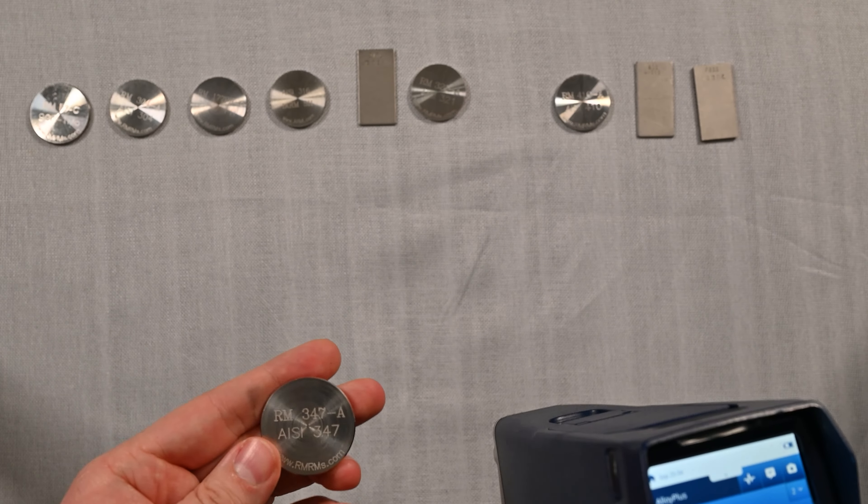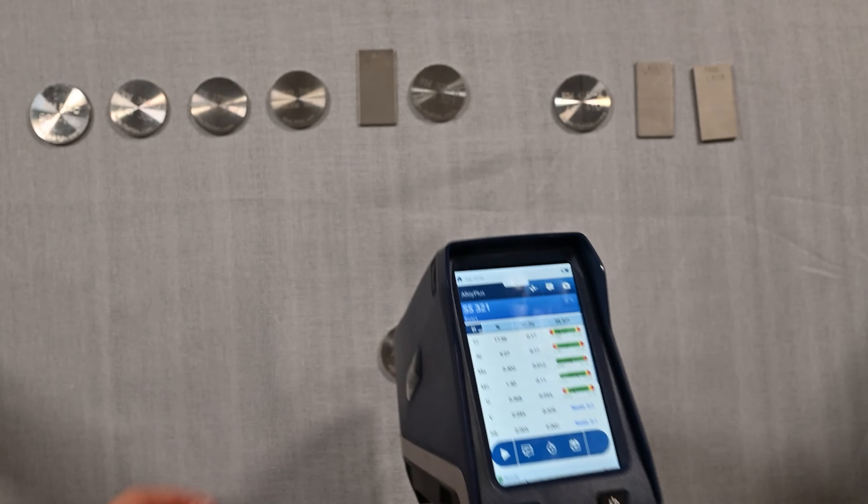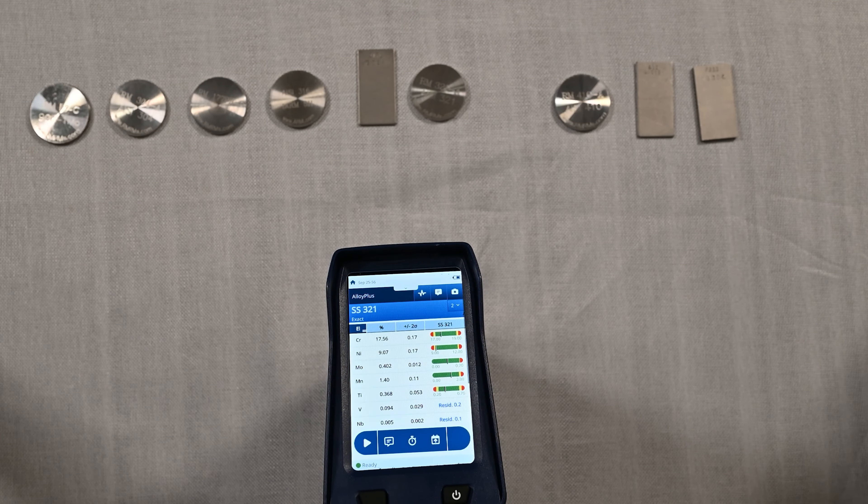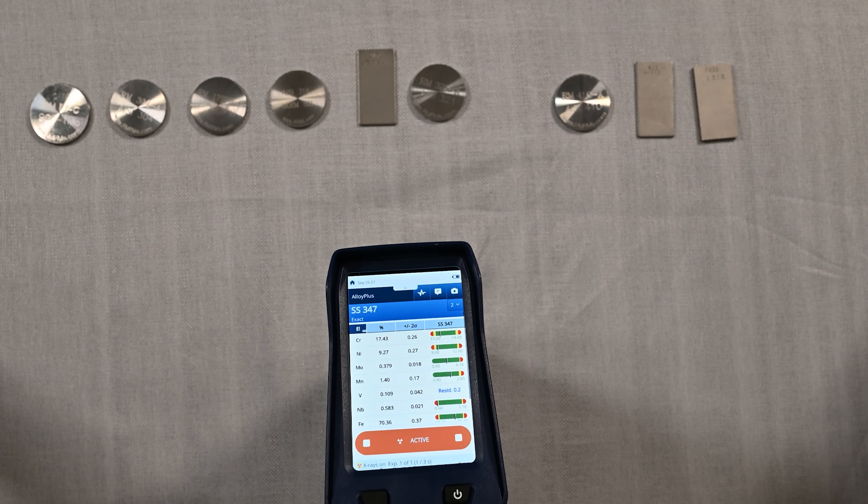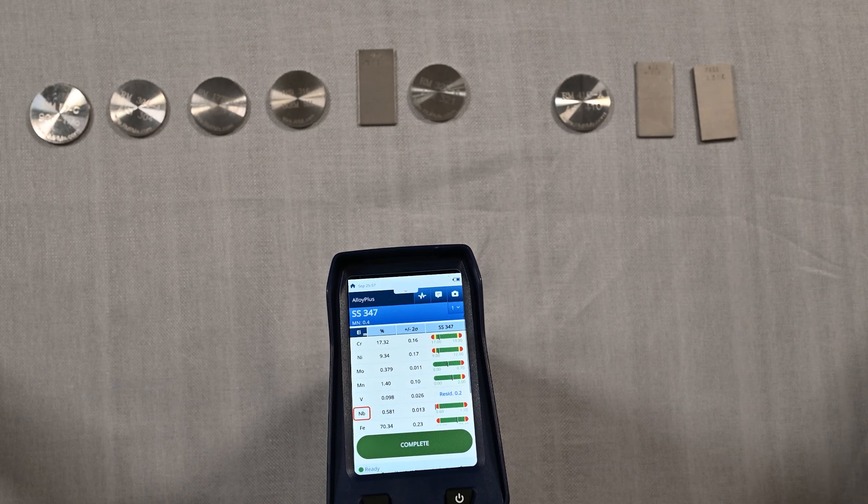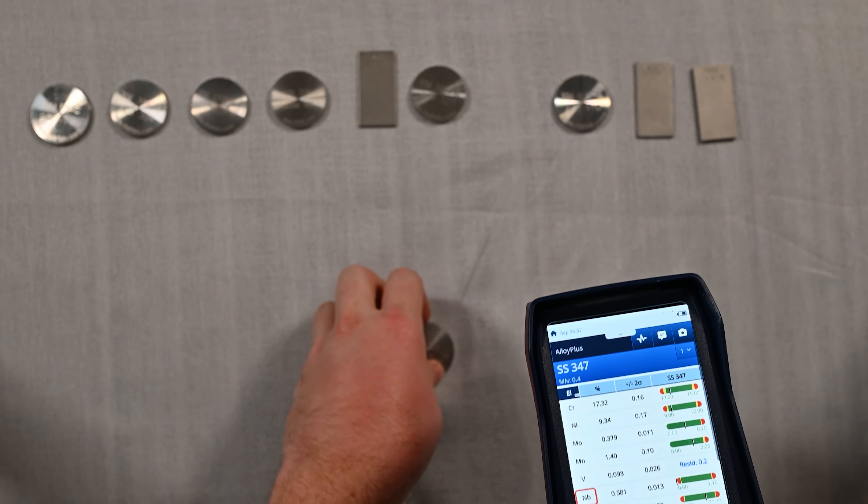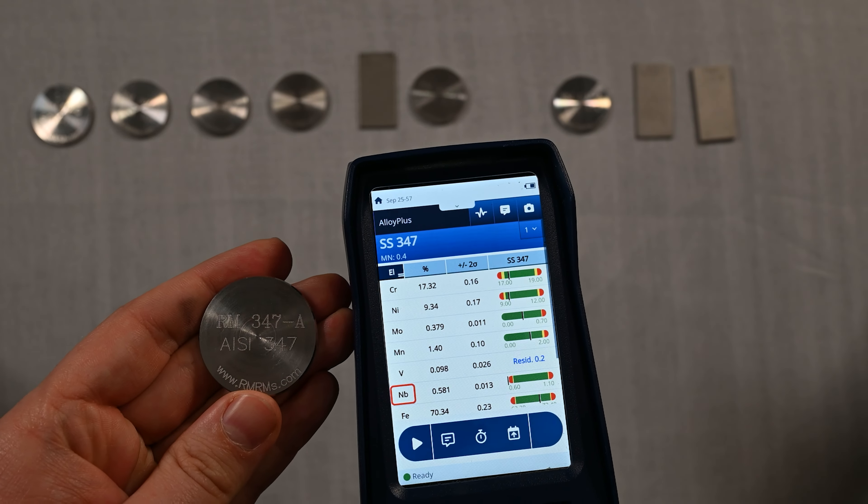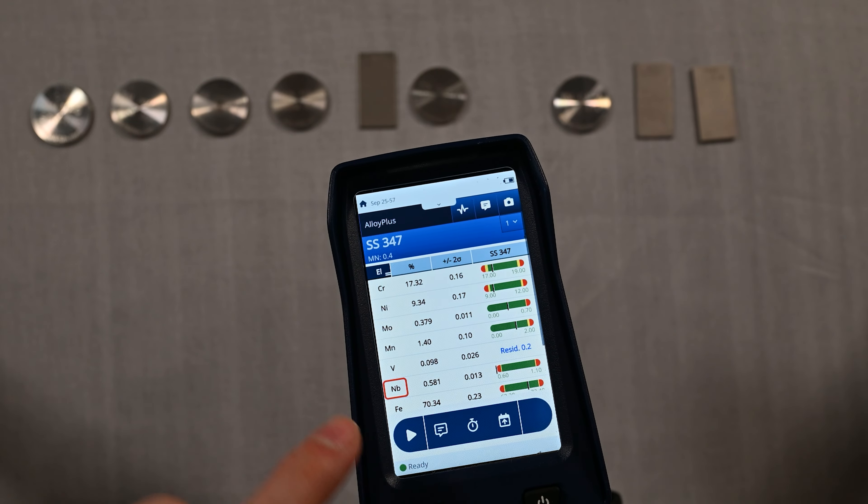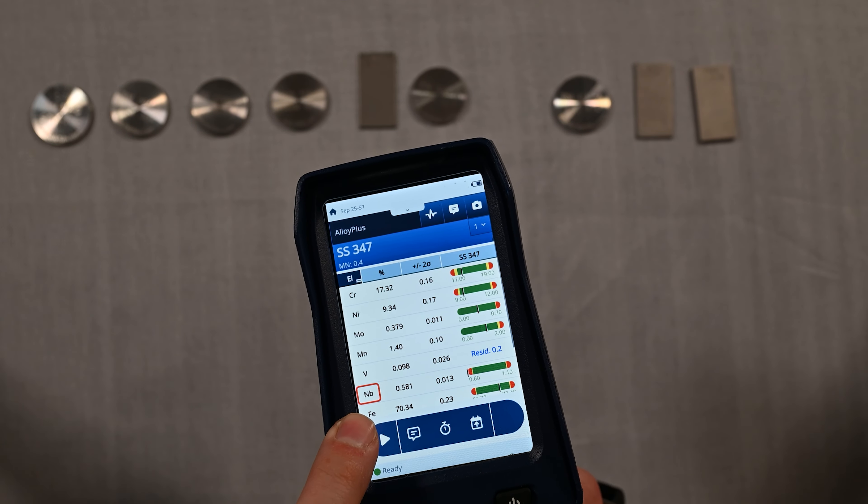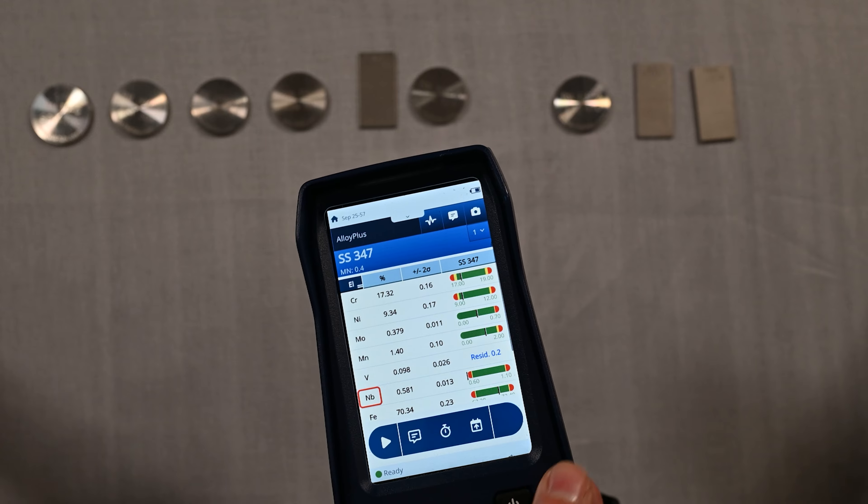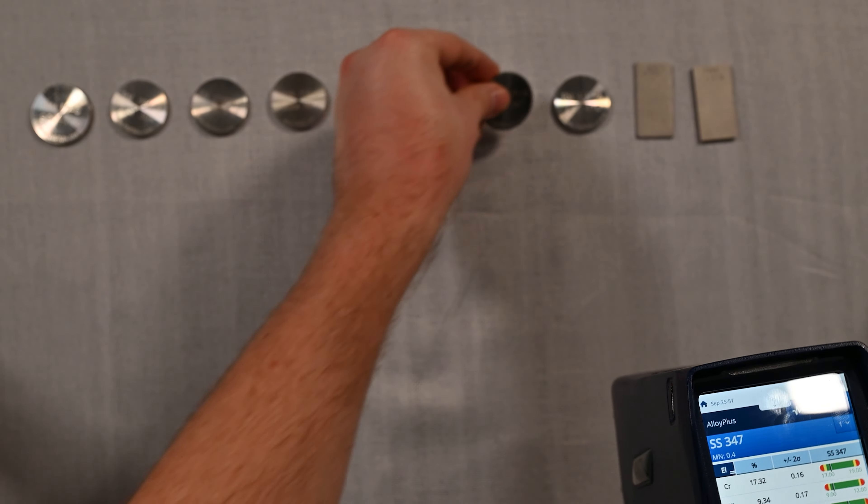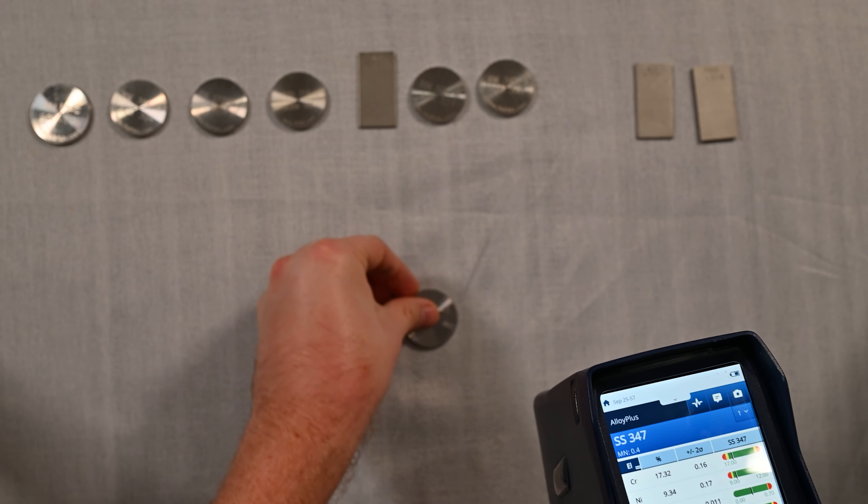A similar alloy here, we've got 347, which is actually very similar to the 321 we just measured. The difference is 347 has a niobium addition. So when we look at this, we're able to see that yes, we got an excellent match for 347 and we were able to identify that niobium value here. Looks like the minimum is 0.6, it might be around that value for the standard. I don't have the chemistry in front of me, but we did a great job in matching that.